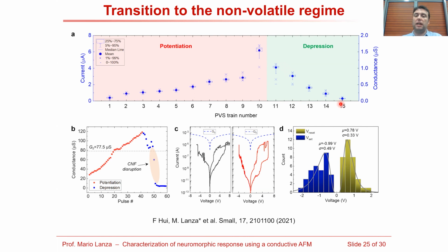But if we apply higher stresses, and especially if we apply them to the copper electrode, not to the platinum electrode, what we observe is that we can increase the conductance above the level of the quantum conductance. This is important because now what we observe is that this resistive switching behavior is non-volatile. We can achieve this set behavior, and now we can only reduce the conductance by applying another stress with the opposite polarity.